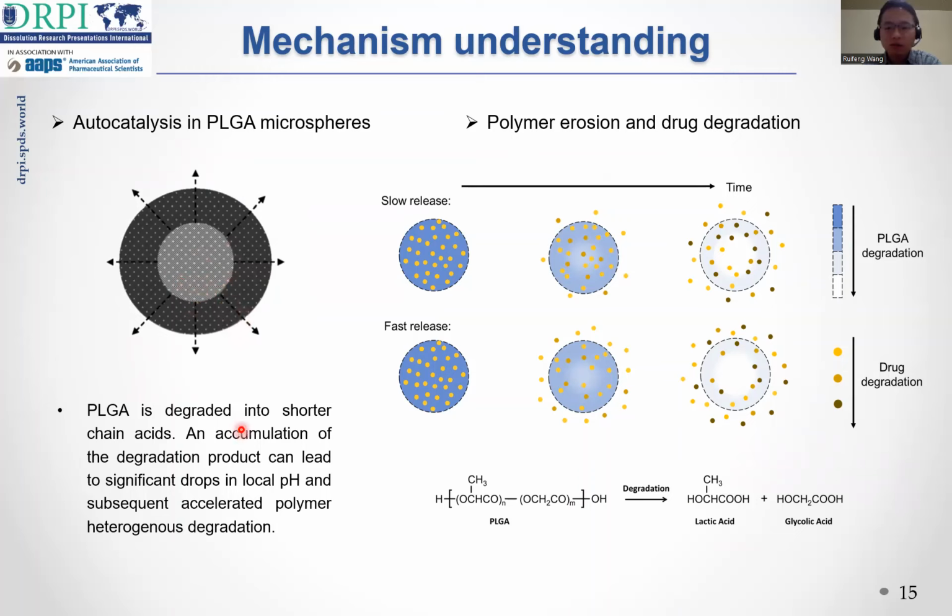Combined with the gray value analysis above, the formulation with a slow release rate could trap more drug degradation products in the microsphere, giving them a darker color, and vice versa.